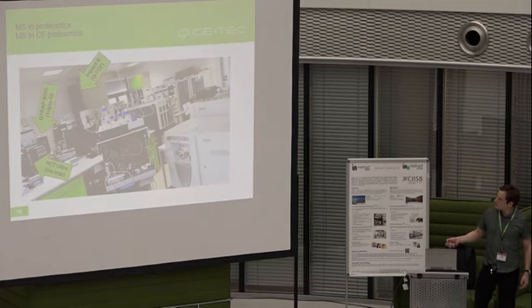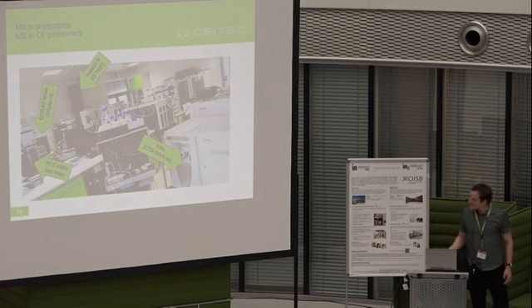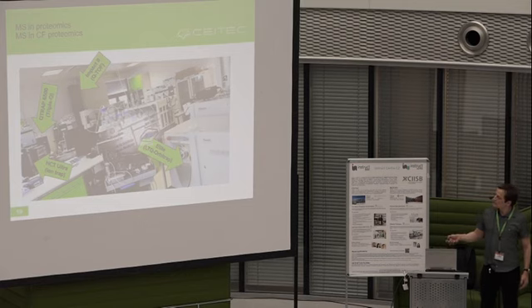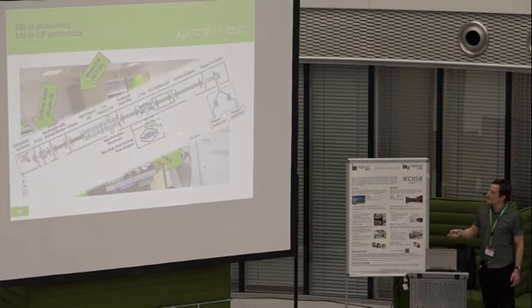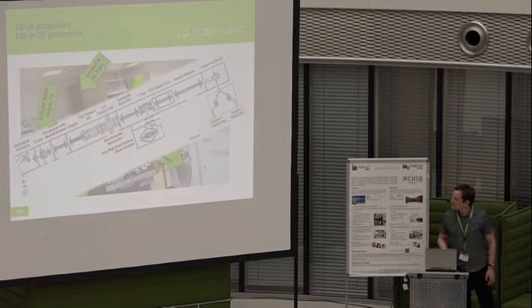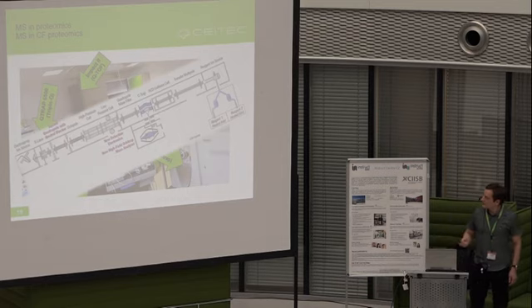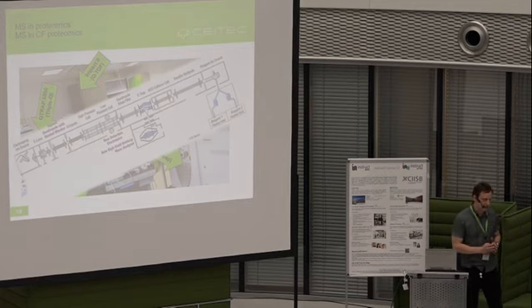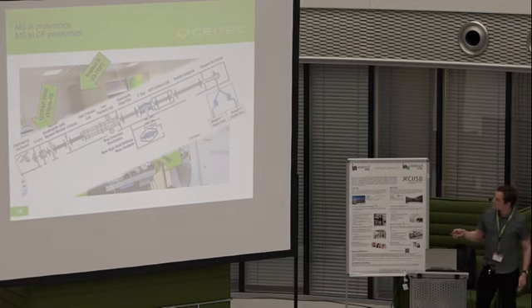And this is the new generation of mass spectrometers based on Orbitraps. And not only is it a special kind of FT-based analyzer, but also inside the instrument you can find many features, many parts of ion optics, so you can play with the ions based on the properties that are desired. For example, for special kinds of post-translational modification, different setups of MS-MS fragmentations are needed. And it is everything available here.